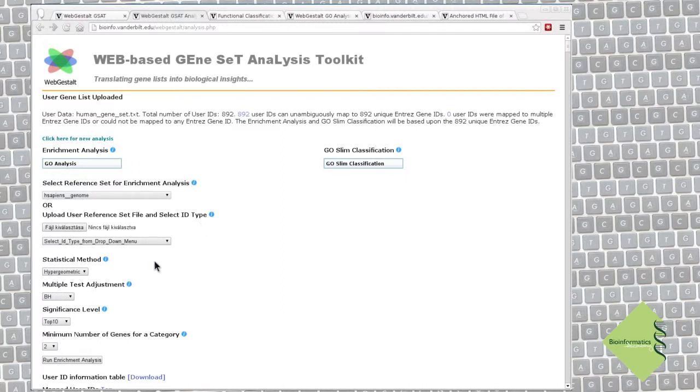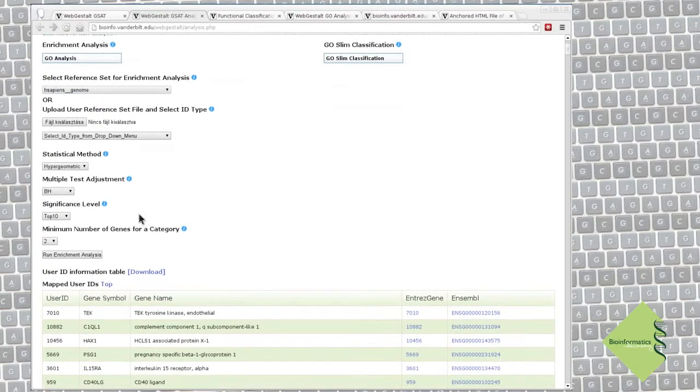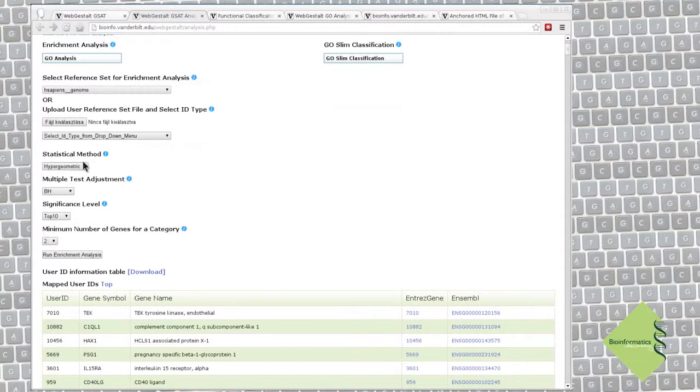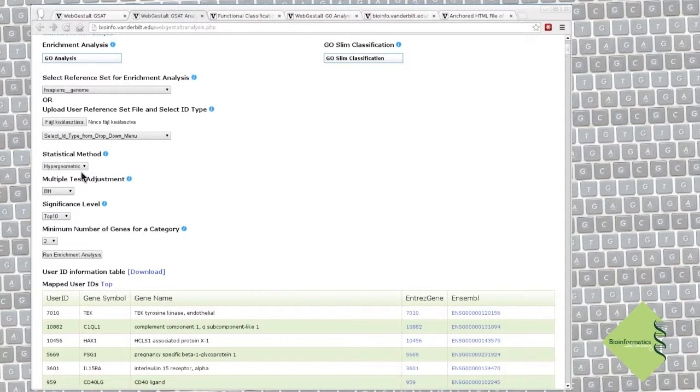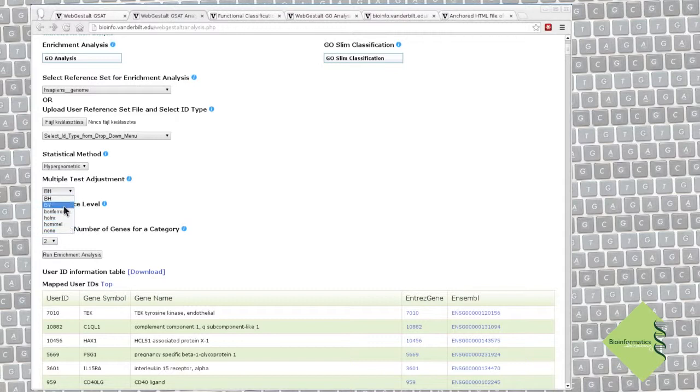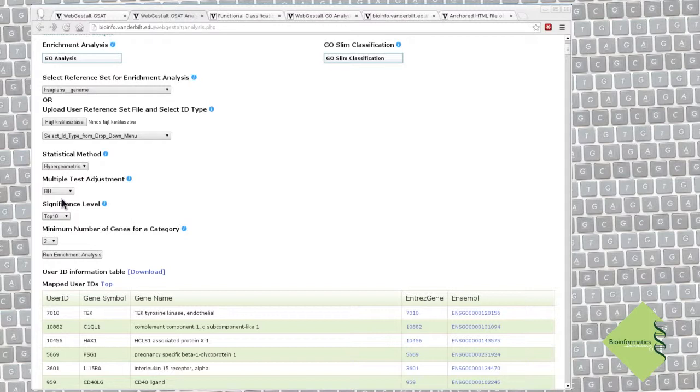Let's continue with the parameters of the analysis. We use the hypergeometric test for overrepresentation analysis, so no surprise here. We have many options to decide which statistics we want to use for correcting multiple hypothesis testing, but we do not have a really good reason to select anything else than the default Benjamini-Hochberg test.